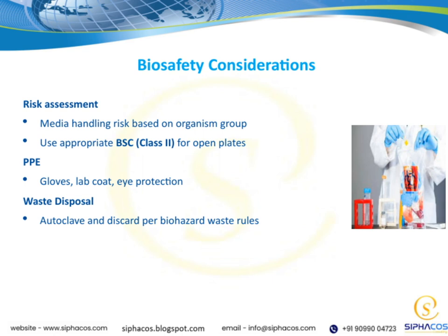Personal protective equipment is also essential. This includes gloves, a lab coat, and eye protection, to create a barrier against any accidental spills or splashes. Waste disposal is another key aspect. All waste materials should be sterilized in an autoclave before disposal, and then discarded according to biohazard waste rules. Following these biosafety steps helps ensure a safe working environment and is a fundamental part of responsible laboratory practice, connecting back to our overall goal of maintaining safety while conducting scientific work.